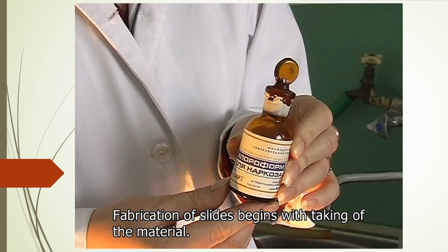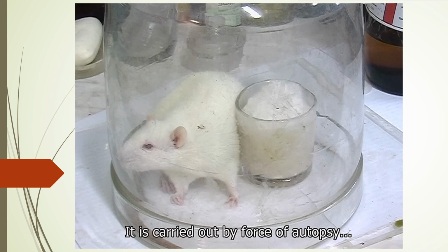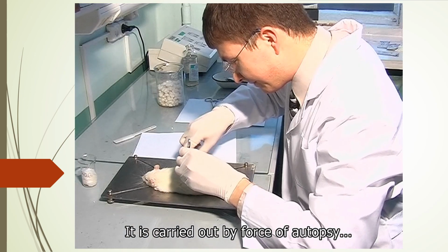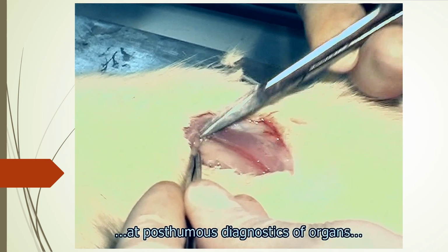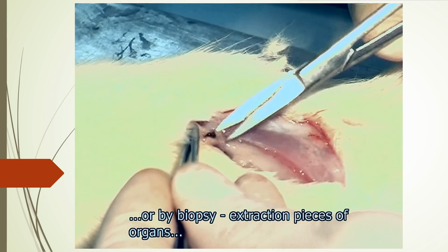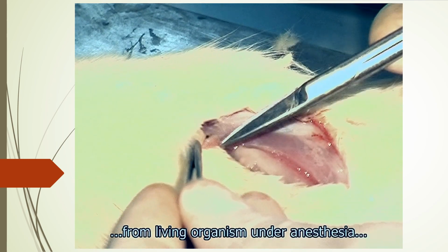Fabrication of slides begins with taking of the material. It is carried out by autopsy, at posthumous diagnostics of organs, or by biopsy, extraction of pieces of organs from a living organism under anesthesia for the aim of lifetime diagnostics.